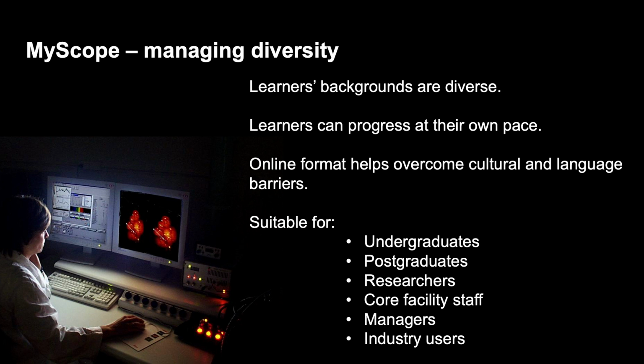And what we really want to do with MyScope is to get this diverse cohort of users up to a level where they can then have a fairly uniform level of knowledge, so that when they come in to the facility for face-to-face training, the people doing the training are not wasting a lot of time going over the really basic things. That is all covered through MyScope.